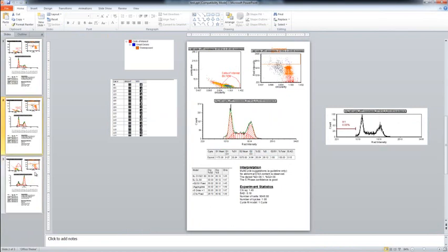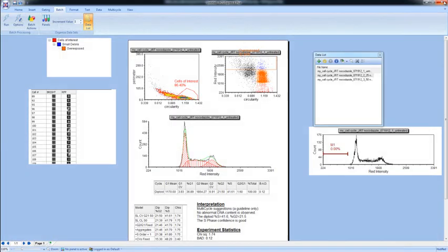We can quickly flip back and forth in PowerPoint now, see the differences in all the percentages, and have all this information summarized in one easy report. So again, what you're getting here is the ability to create these templates if you'd like, load your data quickly and easily into that, get all the powerful statistics, model that data, and quickly publish this to something like PowerPoint or Excel or Word so you can communicate these results as needed.